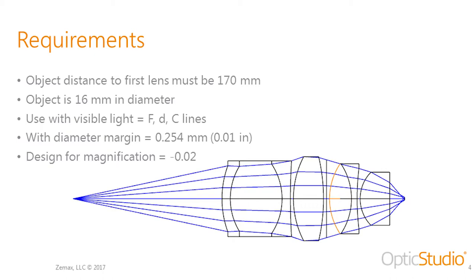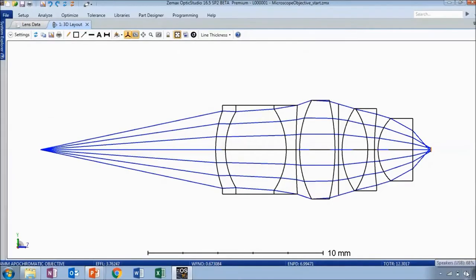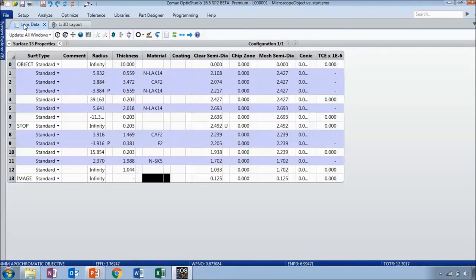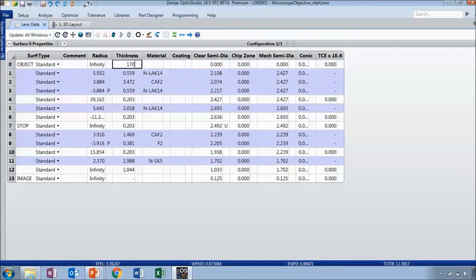I'll switch to OpticStudio. Here I have the sample design file open. This almost matches a design file from ZBase, although we have modified it a little bit. In the lens data editor you can see that my starting spacing between the object and the first surface is 10, but this needs to be changed to 170 millimeters.